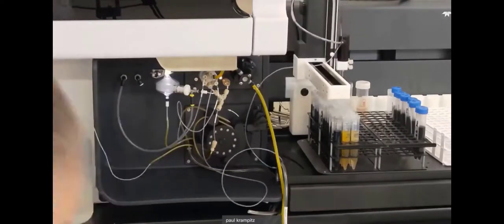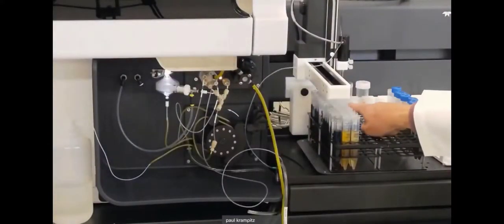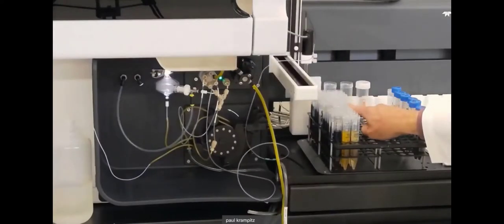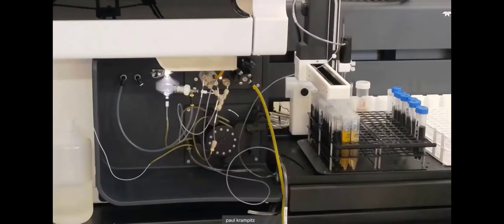Now I'm going to scooch over here. I don't know if you can see where this probe is, but it's almost done. There's 40 samples on here. I started it a couple of minutes before I started this video session, and I've got about three more samples left. So we ran 40 samples in a hurry here, especially at 17 seconds a sample.